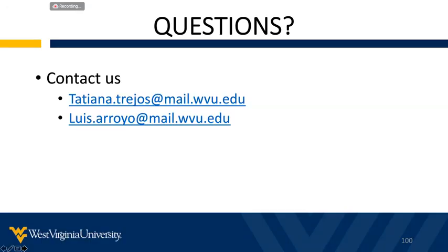Okay. So it varies by the type of method that we were using. In general terms, for example, for the neural networks, we used the K-fold option, dividing the data into 3 subsets: 60% of the data for training, 20% for validation, and 20% for testing. So we used a K-fold option 5 times, processing the data 5 times with different combinations of the data sets to ensure the algorithm was being properly trained.